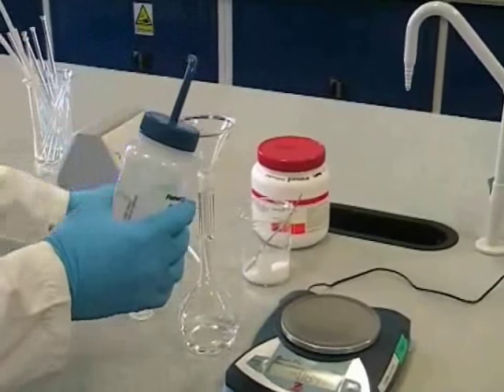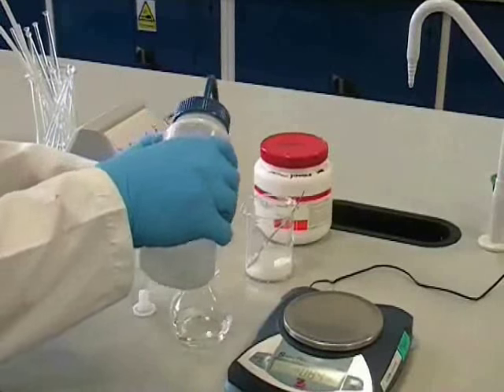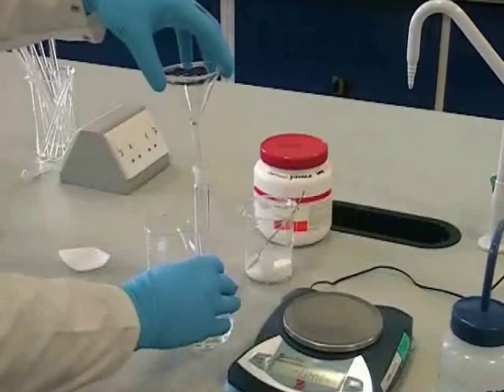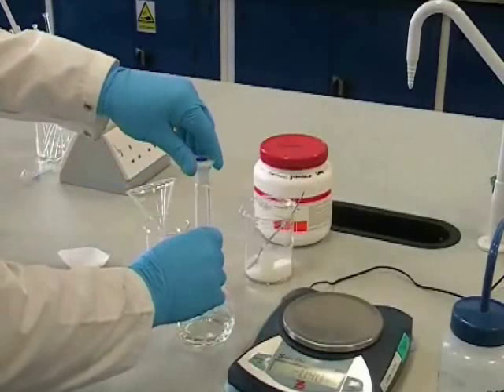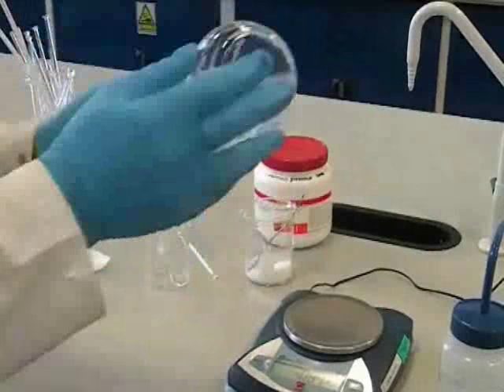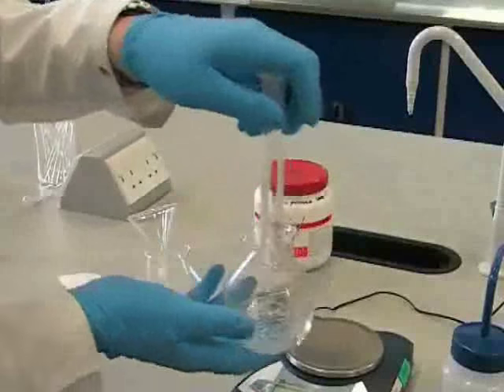And having rinsed the beaker, it's also important to rinse the glass funnel to make sure that none of the original solution is left in there either. Once you're happy with the rinsing, you can remove the funnel and place a stopper into the volumetric flask. And gently shaking the flask at this stage ensures that all of the solute is in solution and is easier to do than when the flask has been topped up with water.